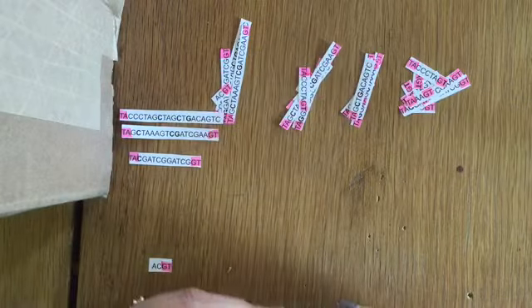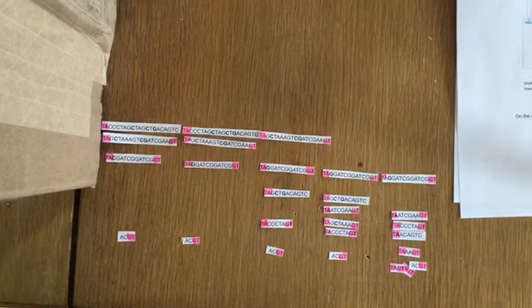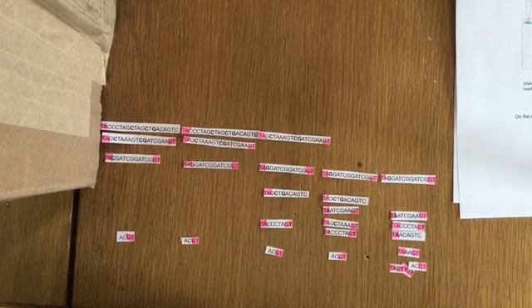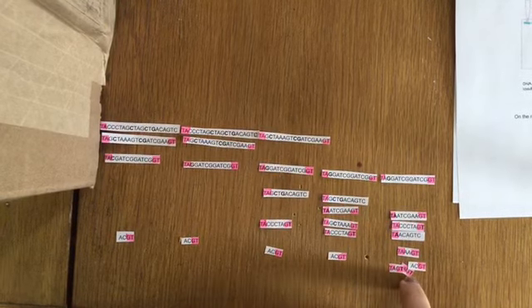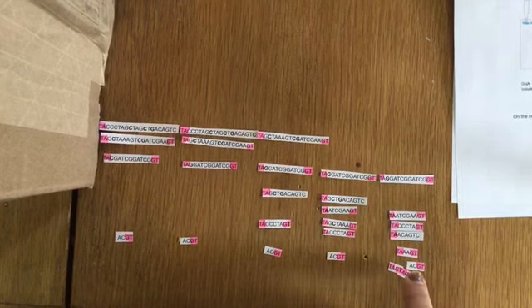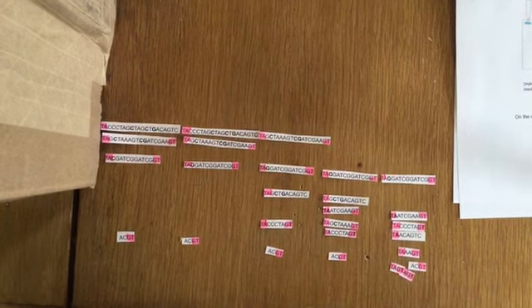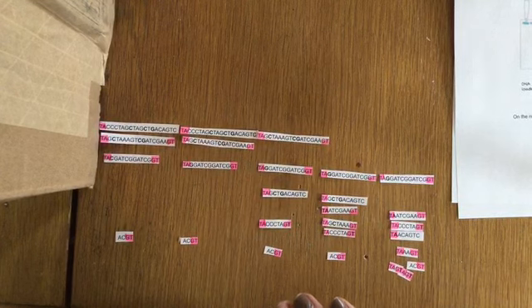So I'm going to make all of these migrate off camera and then show you what this kind of looks like. All right, so here we can see the migration of all of these things, and we just arrange them according to size. If we have a bunch of bands that are all the same size, so we have here on the dog, we have 3 segments that are 4 base pairs long, that's going to make a really, really thick band on our gel. So what this actually looks like is on the very last page of your assignment.